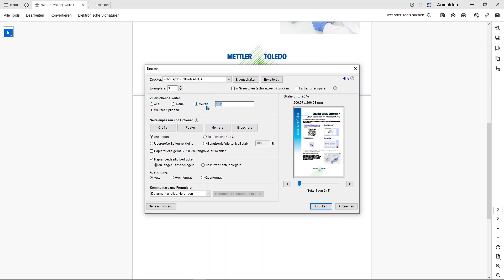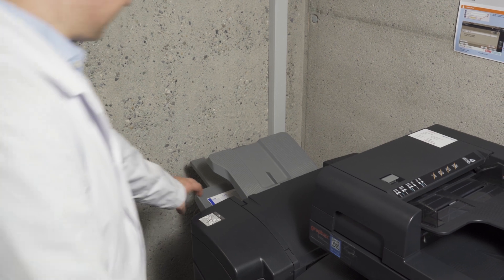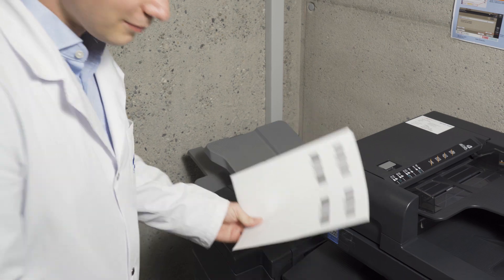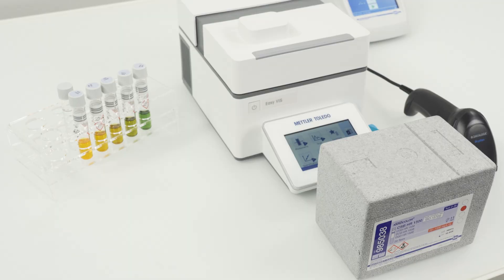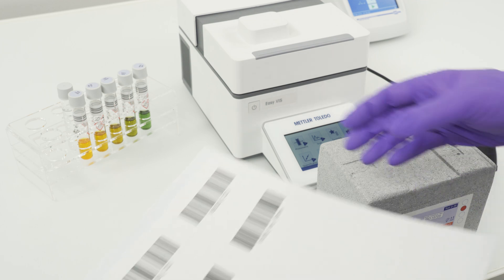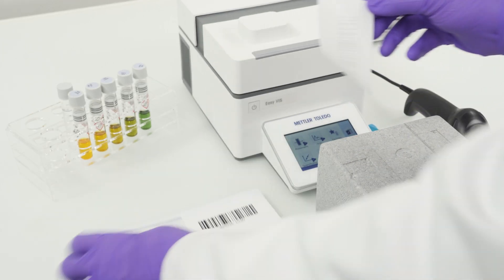Let's proceed to the printer and pick up the label. Having now printed our barcode on the label sheet, we are ready and prepared to analyze our sample. So let's go to the lab and start the workflow. I am fixing the barcode label to the lid of the test kit box, but you could also put it onto your SOP.